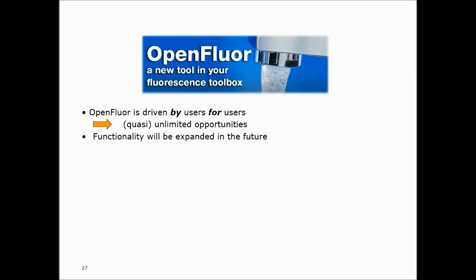For example, specific contaminants and their fluorescence properties could be uploaded to the database, similar to what we've done in the last year with simple organic fluorophores that were more interesting for dissolved organic matter studies. But yeah, this can be expanded quasi-unlimited.